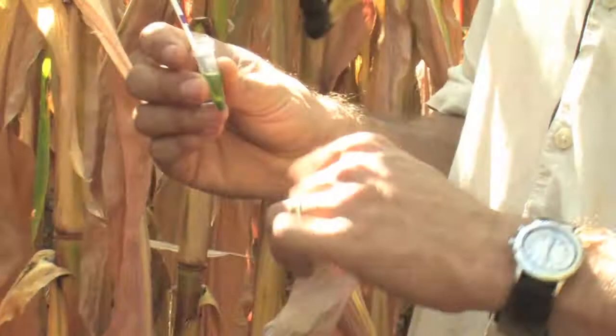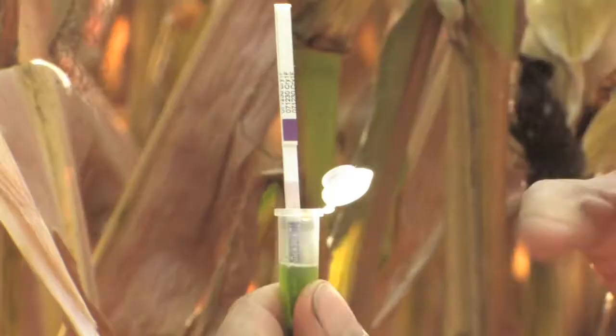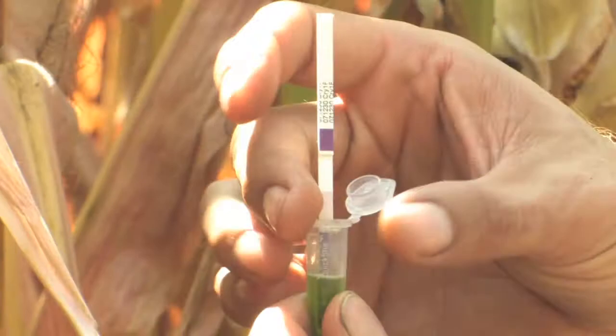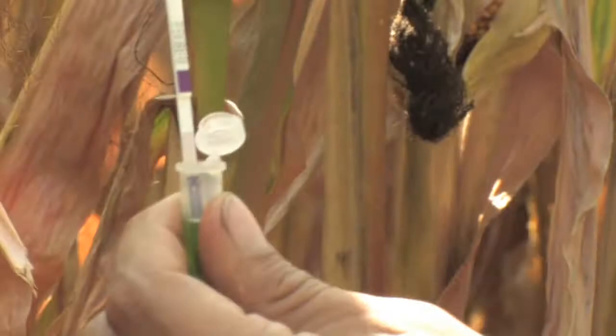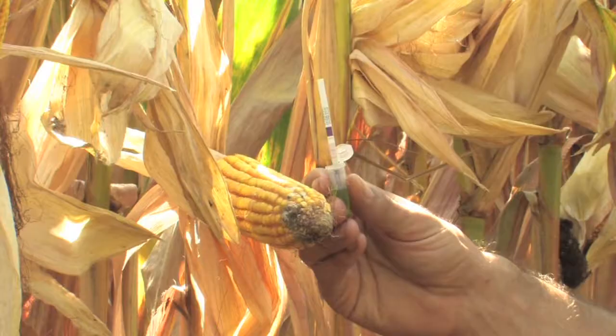Now once you've got that tissue ground up a bit and you've got this greenish color to the liquid in there, it's just a matter of putting that stick in there. You can see if you close up on the stick, it says Cry1F — it tells you what protein you're going to be looking for. You'll give it about two minutes for the liquid to work its way up this stick and give you either a positive or a negative test. And what you'll see is two distinct pink lines, and that tells us that this plant is indeed expressing the Cry1F gene.